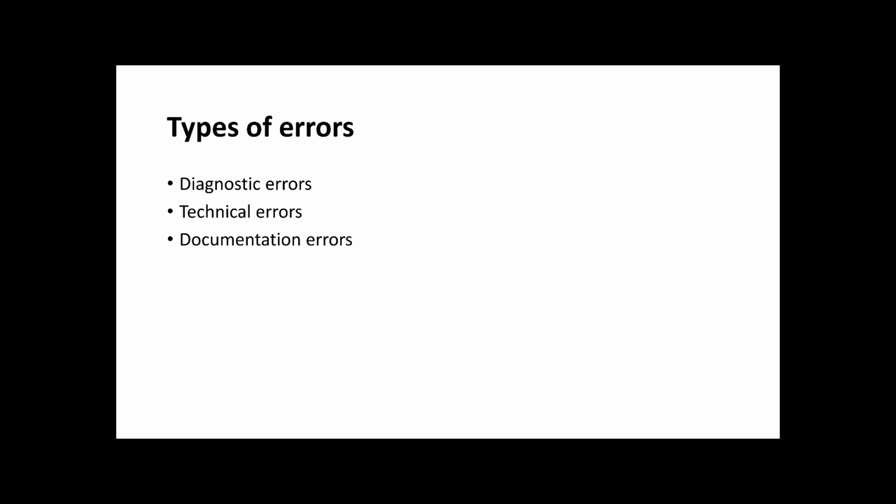The second category is technical error due to faulty smear taking or preparation of stained slides. And last but not least is documentation error, which can lead to erroneous reports being issued with potentially disastrous results.